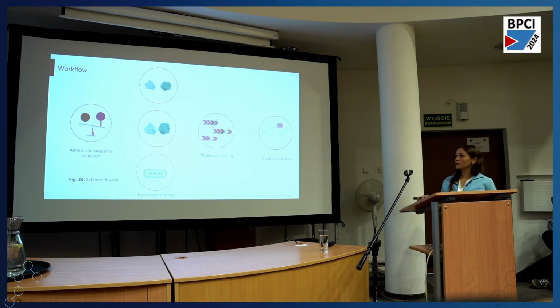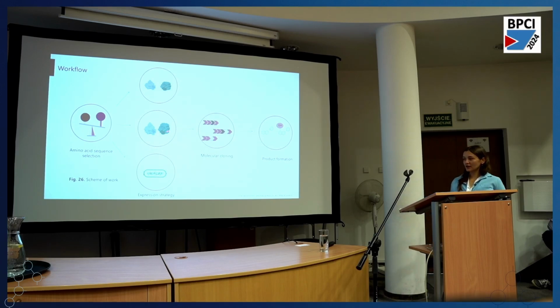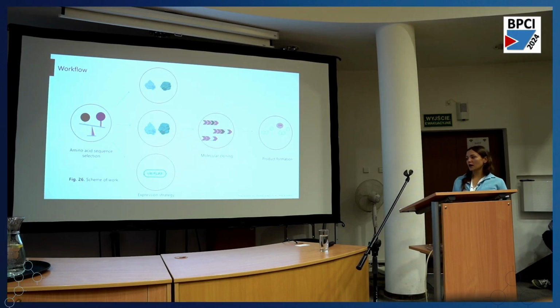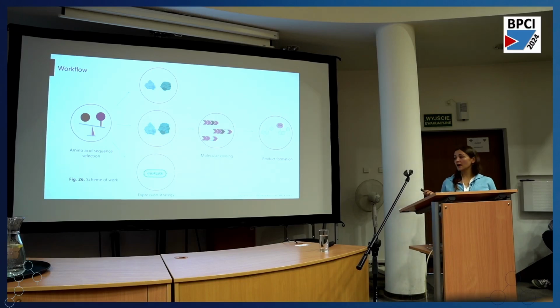The first 2 are based on plasmid expression, in which in the first, separate genes were expressed, so separate proteins of course, and in the second, a fusion protein was involved. The next part involved using the SIGA platform to incorporate those genes into the bacterial genome. So today I would like to talk about these first 2 approaches.